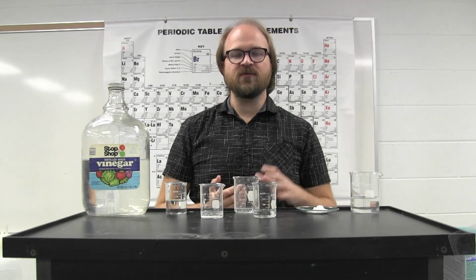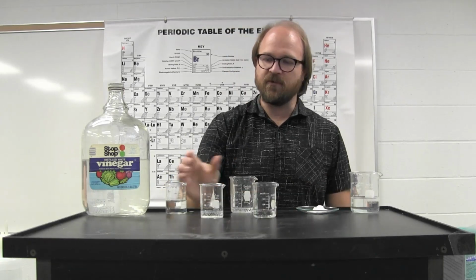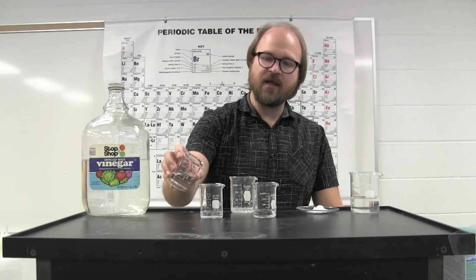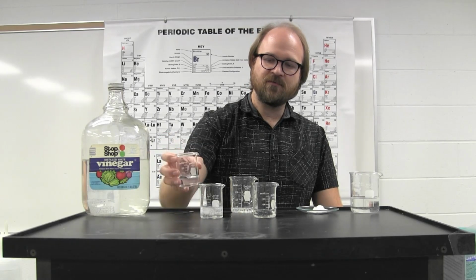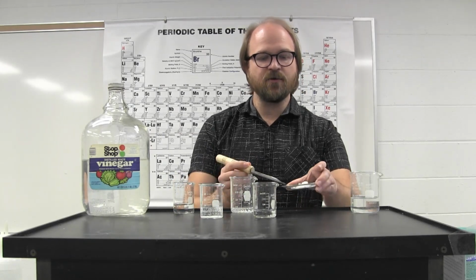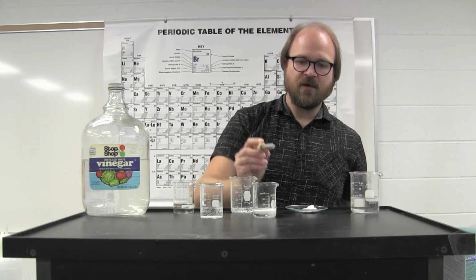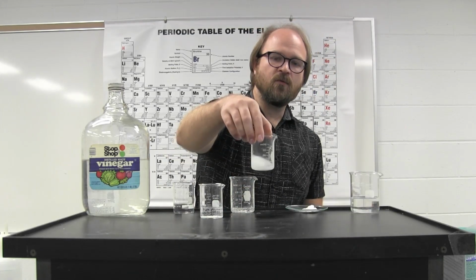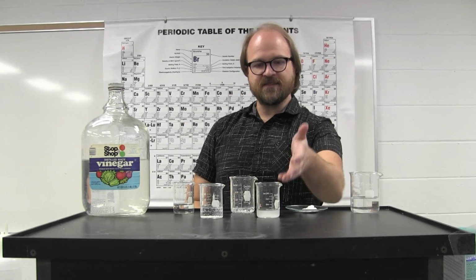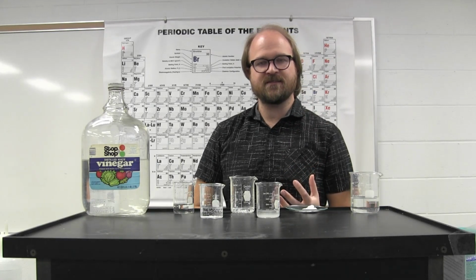And just like was shown earlier with the magnesium and hydrochloric acid example, you're going to take your solutions and to one side add a little bit more vinegar. Nothing really happens. And to the other side, you're going to add some solid baking soda. And when you do that, you'll see, in this example, I'm seeing the reaction happen. There's more carbon dioxide released.